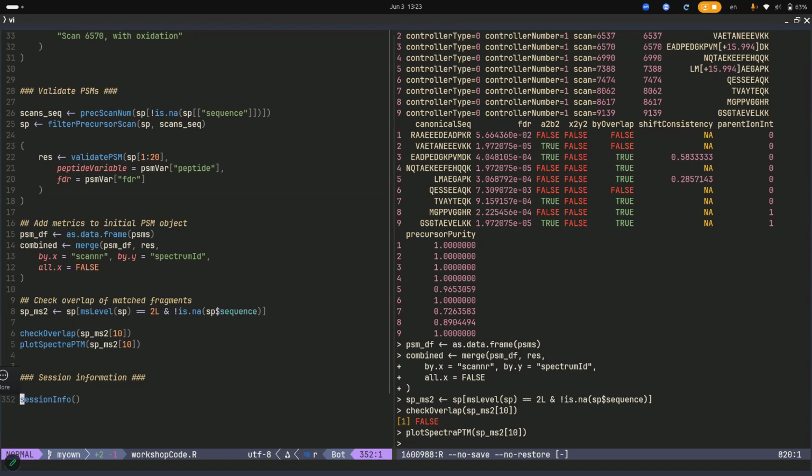No. So PSMatch for now isn't. You do get an idea with the precursor purity whether the initial peptide was well selected for fragmentation, or if a larger window caused multiple precursor ions to be selected for fragmentation. But further than that, you still have one identification per PSM. So for your PSM, you have only one peptide, so you'd only match those theoretical fragments for that peptide.